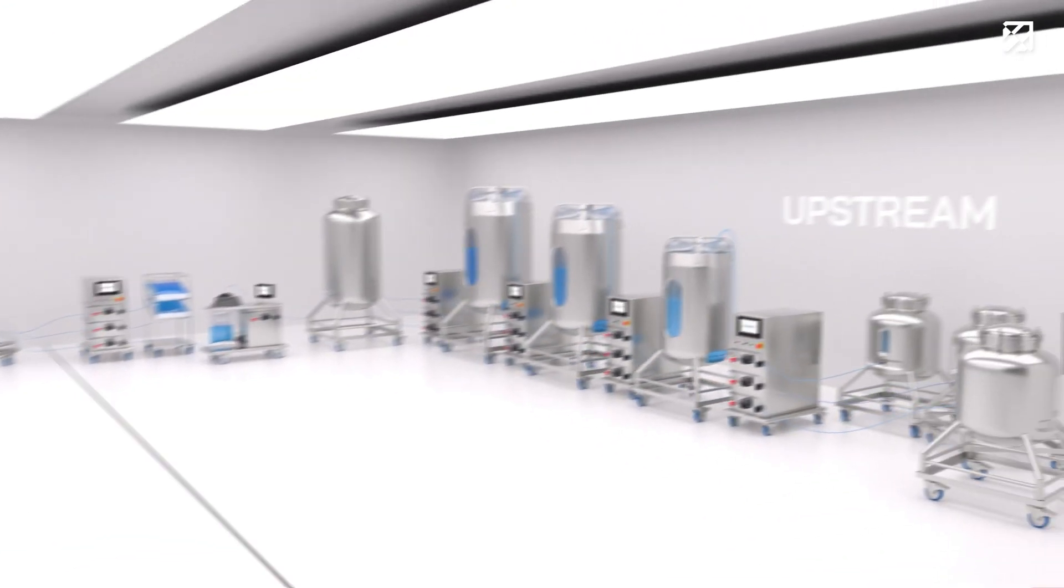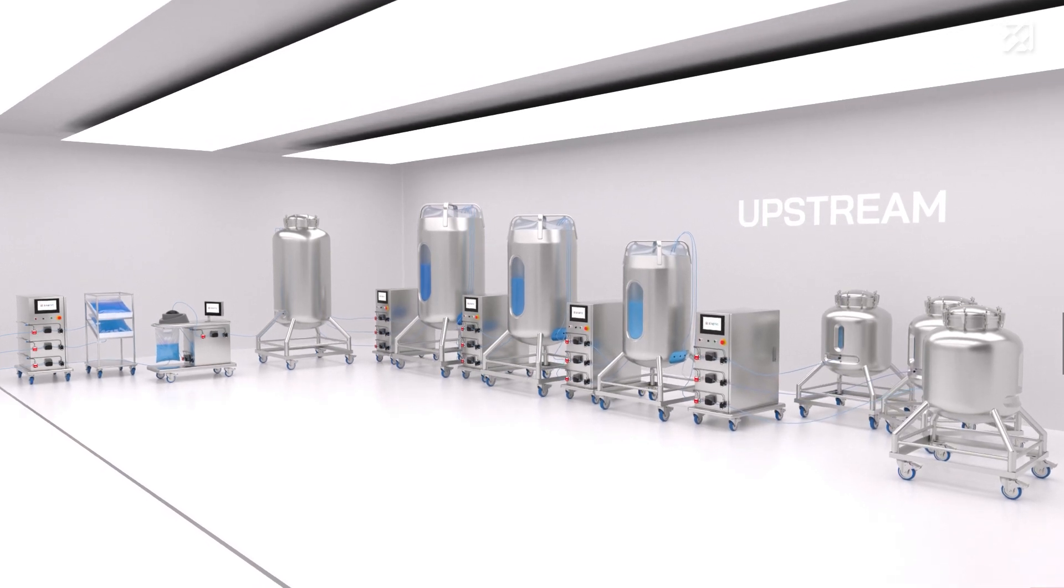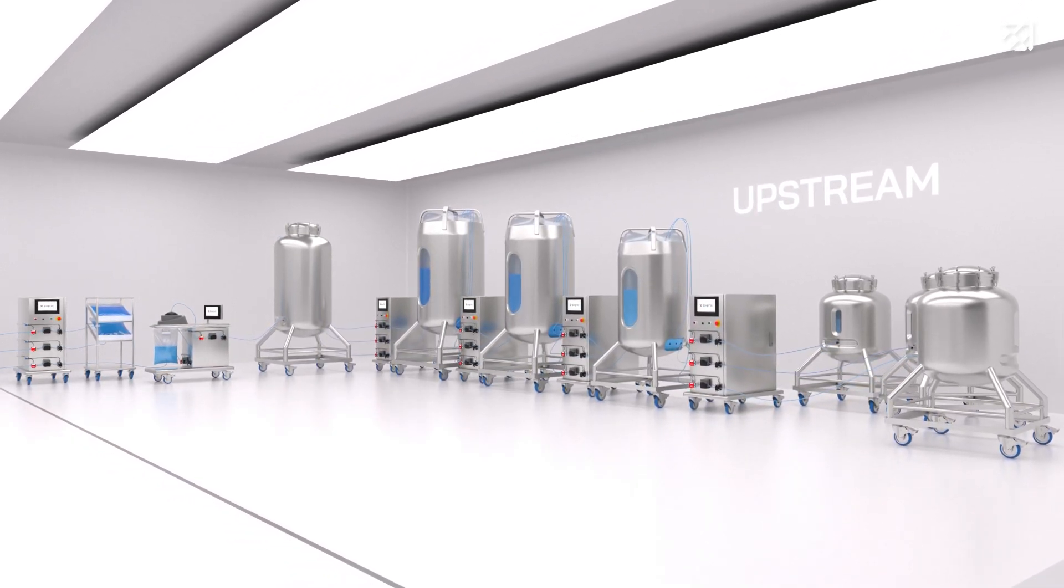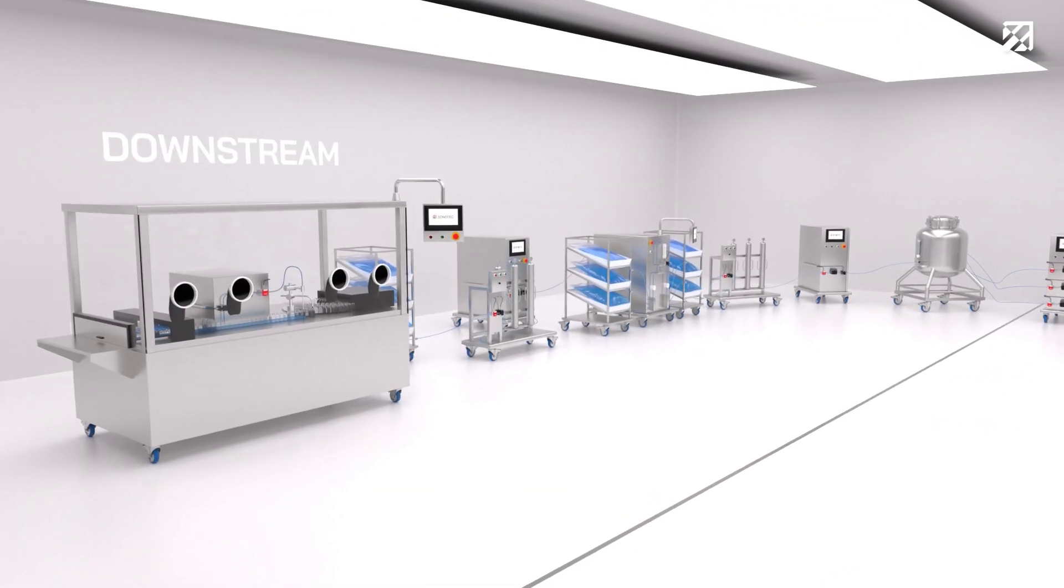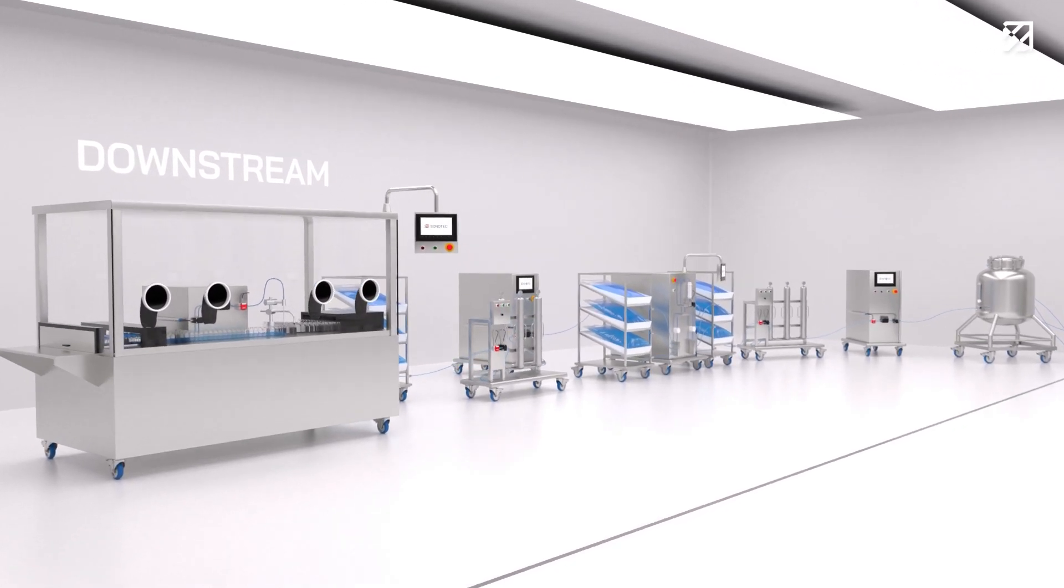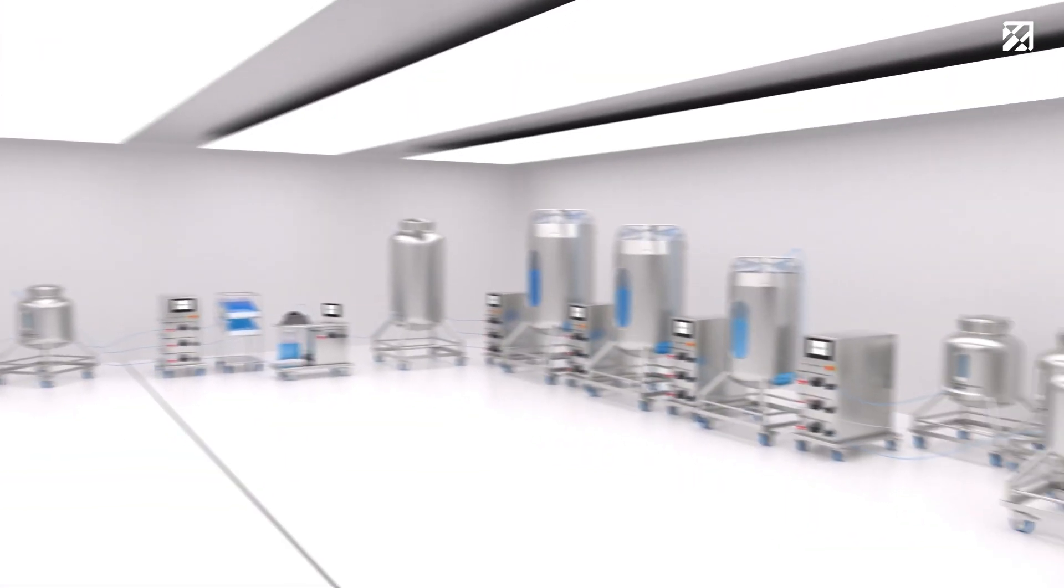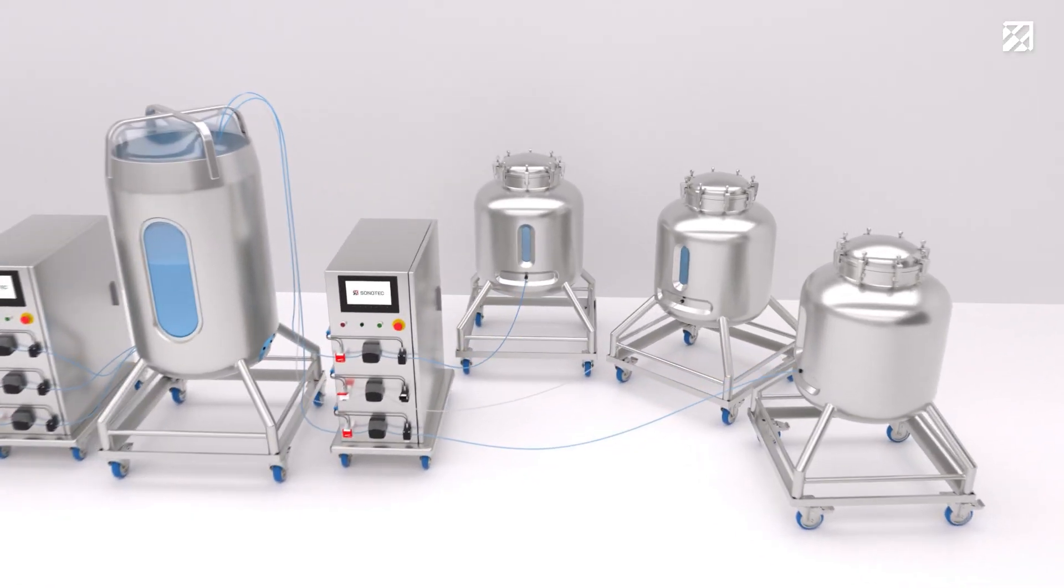Flow measurement and air bubble detection are essential in bioprocessing to achieve excellent reproducible product quality. By implementing non-contact clamp-on sensors, you benefit from a number of advantages.